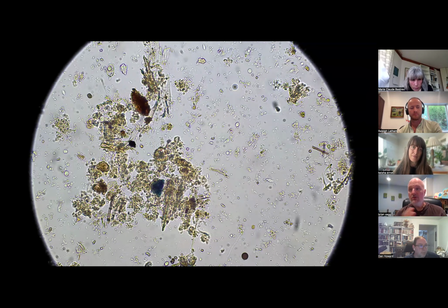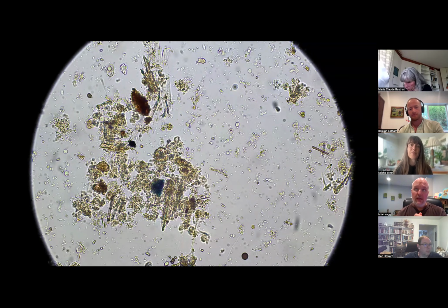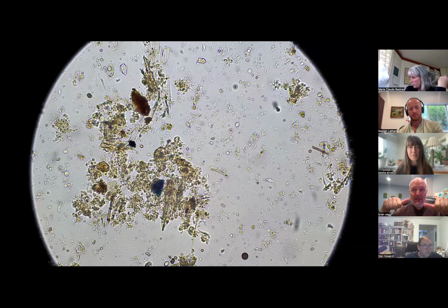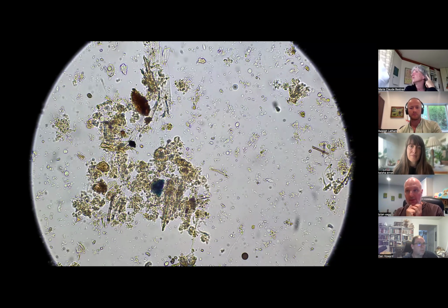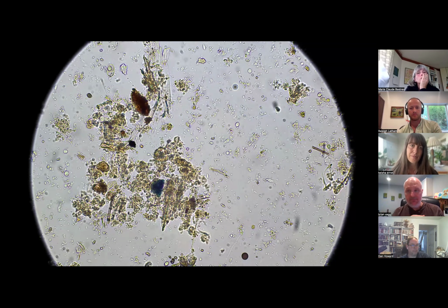And we look through a certain number of fields of view. And if you did see so many of them, we try to create a scorecard saying it's in an area of microbial health of, yeah, probably good or meh or not so good. As Keisha mentioned, we've been working with clients for a long time frame. A lot of our clients do not need the quantitative. What they really want is just how has their soil evolved over time, and a qualitative analysis is perfectly fine for them. It saves them money, and it's also something that you can teach them to do.